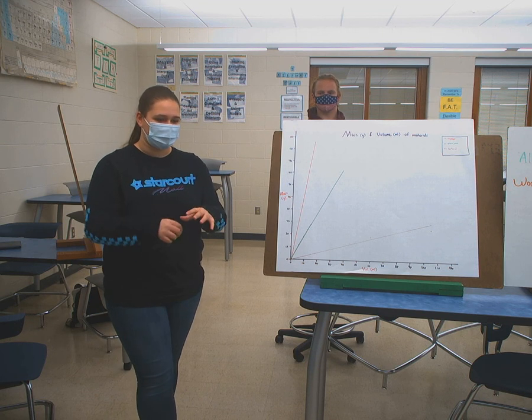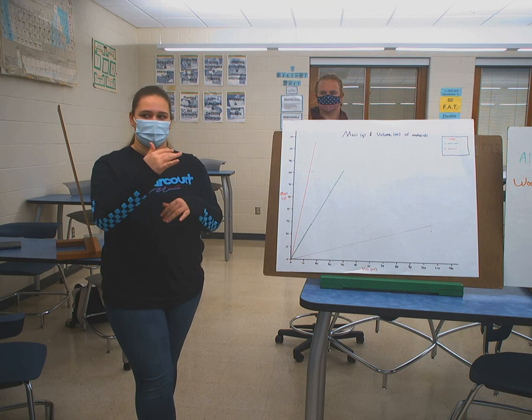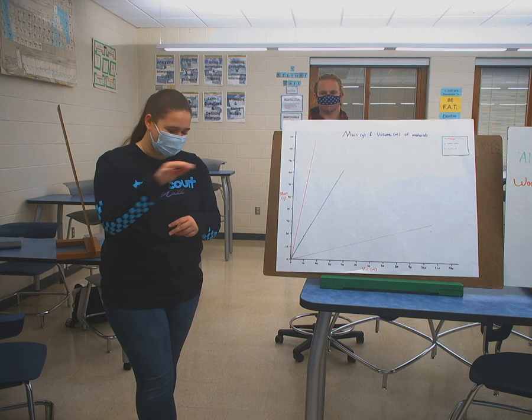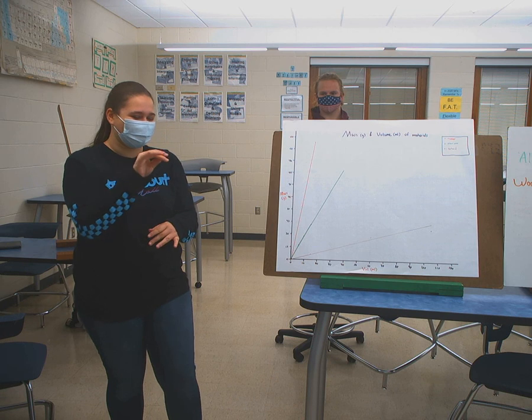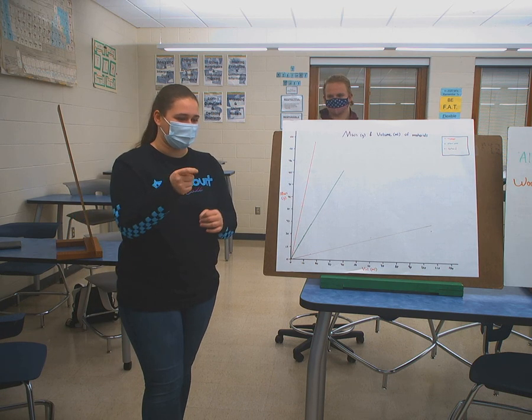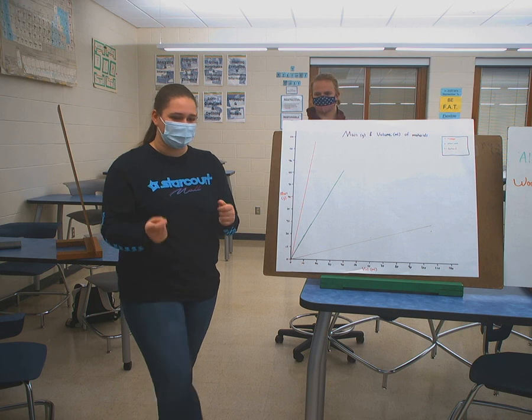Then we put the piece in it and wrote down how high the water went after, and subtracted it.